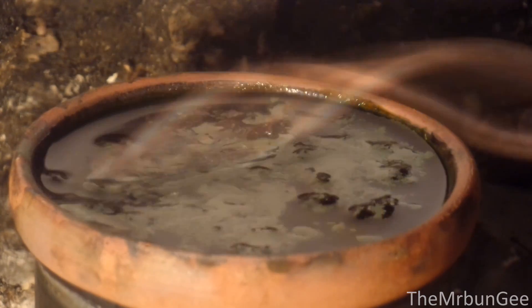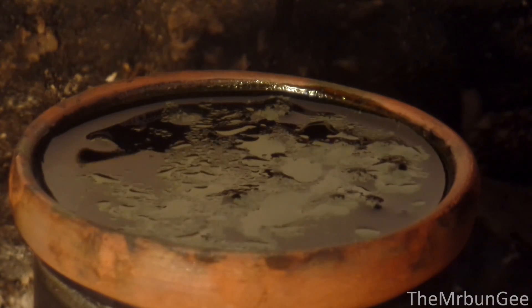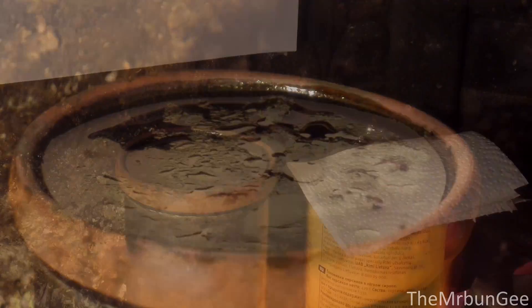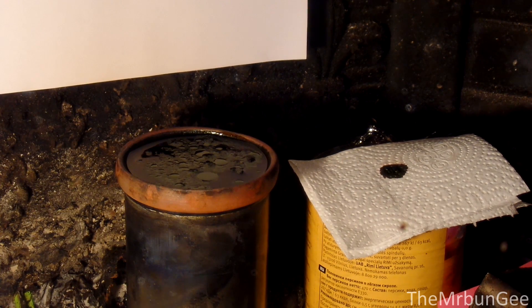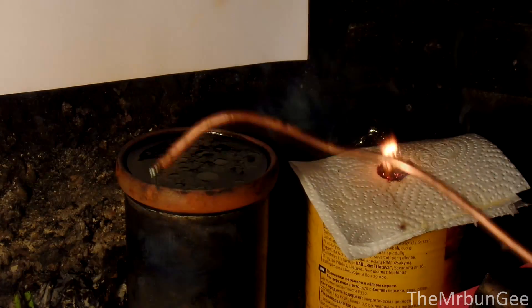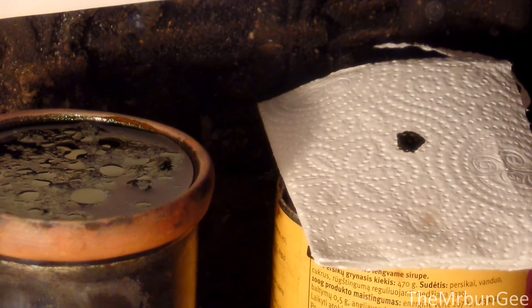I added more permanganate crystals. Let's test it on a paper towel. Sometimes it does not stick to the rod, so the reaction delays.